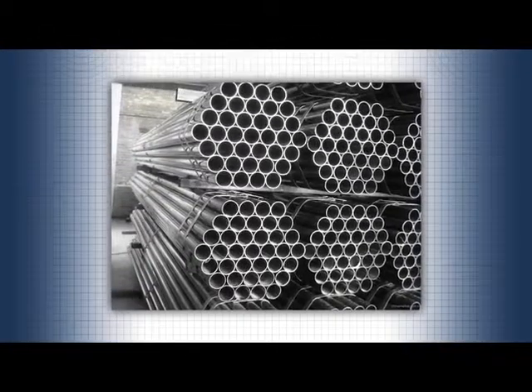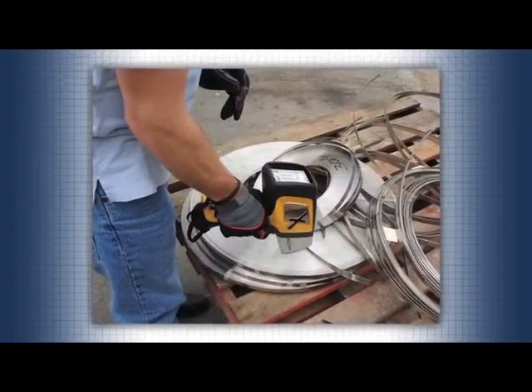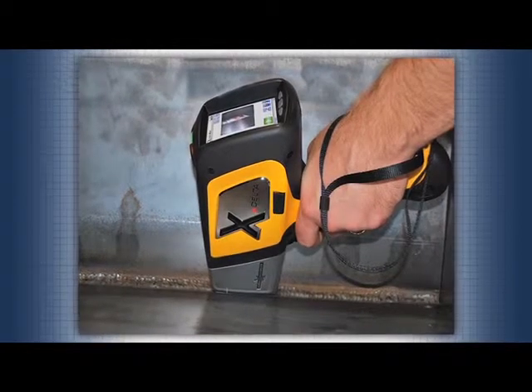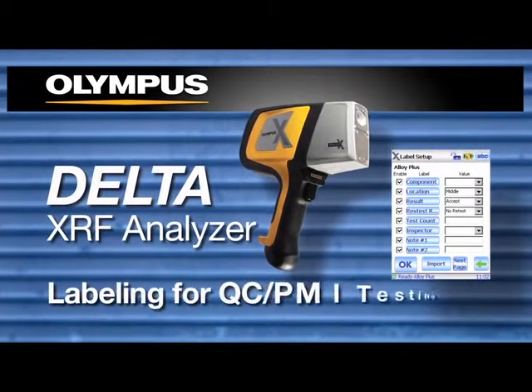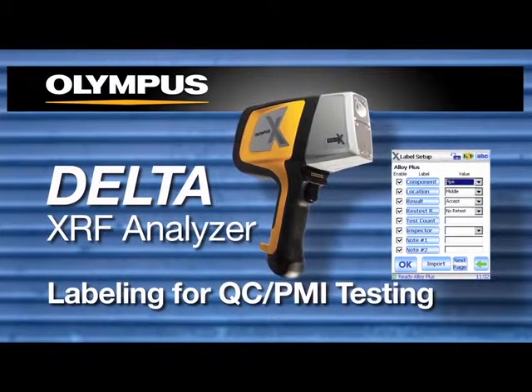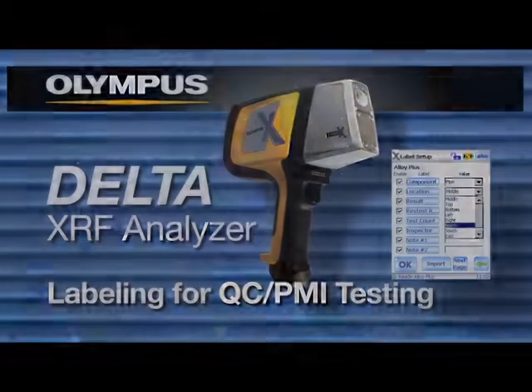As you can see, whether PMI testing is for quality control or in-service testing, the approach to real-time test labeling is similar. The Delta XRF Analyzer's real-time labeling feature is a valuable aid in gathering reliable test data that is critical for accurate PMI testing.